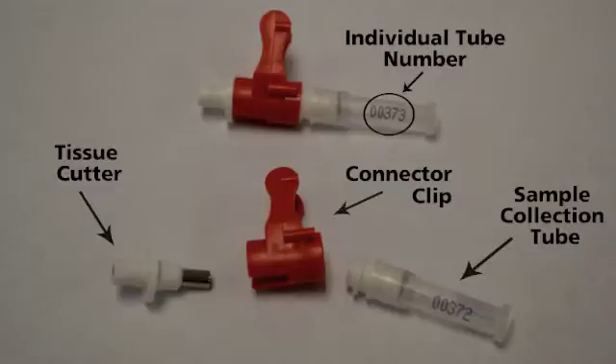The tissue is punched directly from the ear into the collection tube, which self-seals when the cutter is retracted. Each sampling unit is labeled with a number and a barcode, and it is important to record the number of the sampling unit that corresponds with the animal you collected the tissue from.